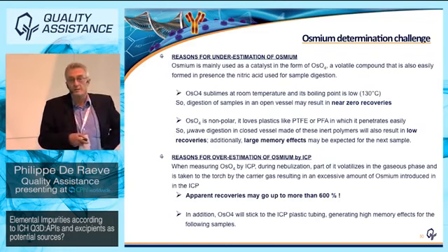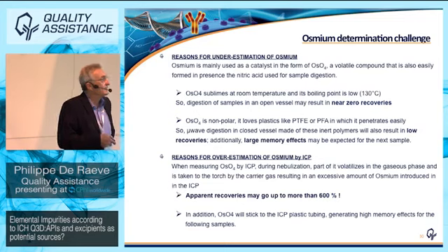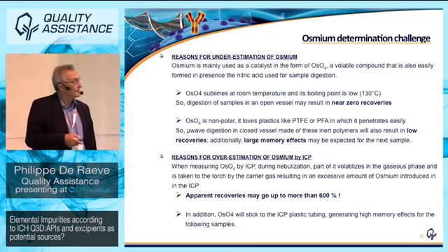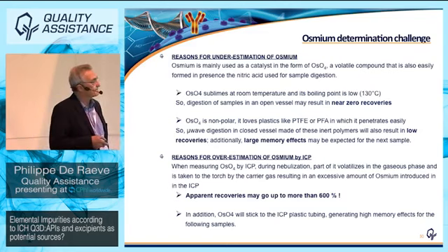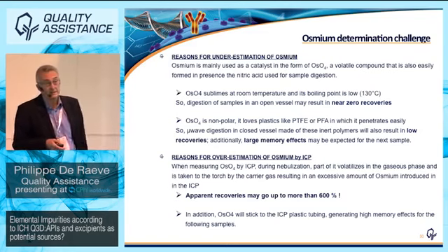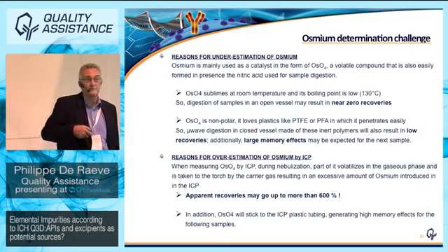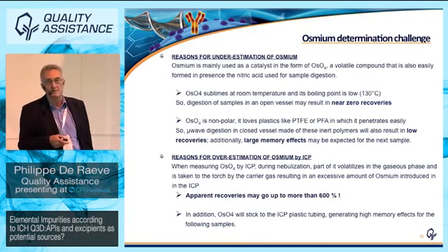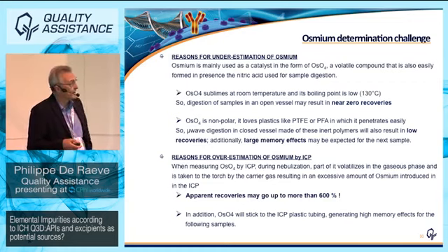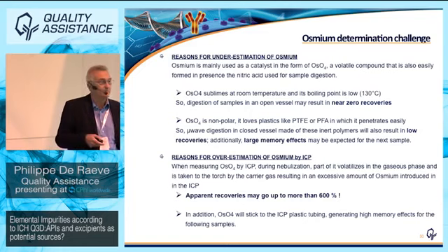It is also a very non-polar product. It loves plastic like PTFE or PFA, in which it penetrates very easily. So microwave digestion in closed vessel made of such inert polymers will also result in low recoveries. And additionally, you will have large memory effect in the next sample.